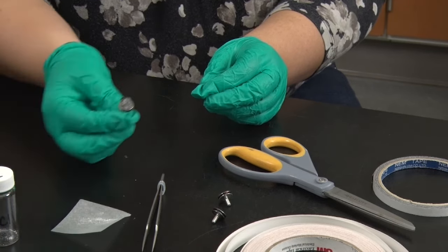Now we're going to switch to low vacuum mode and continue to image the uncoated salt sample. Remember that in low vacuum mode, we introduce some water vapor in the chamber that will help prevent charging. This is the same area of the sample we were just looking at, and you can see that now I can collect a much nicer image than I could in high vacuum mode.